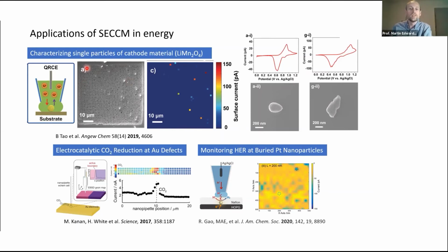Practically, this is an area that was imaged. You perhaps can't see the spots perfectly, but each of those spots on there is a separate image. And the bright parts are the particles. So this is an SEM and it's a carbon support, for those of you that care, but I encourage you to go ahead and look at the reference for the real details.